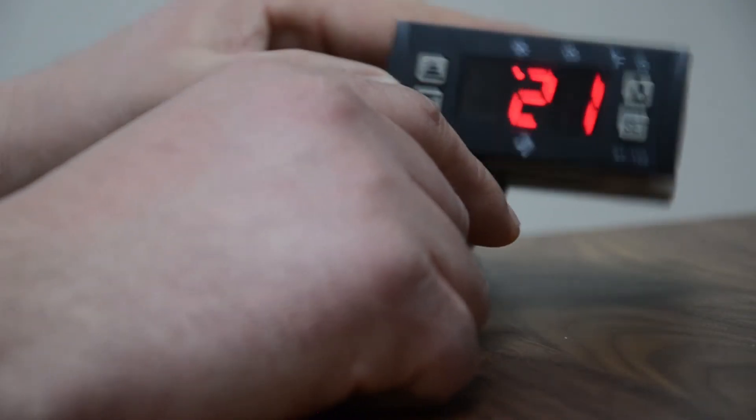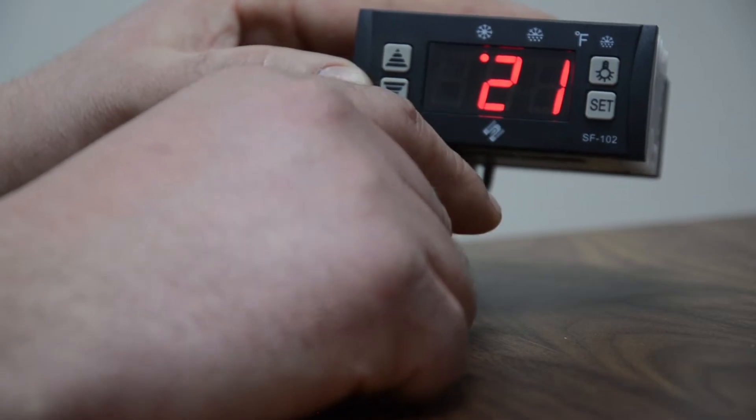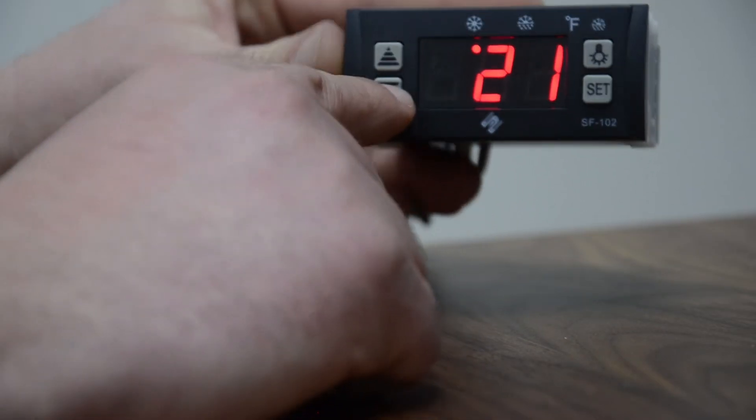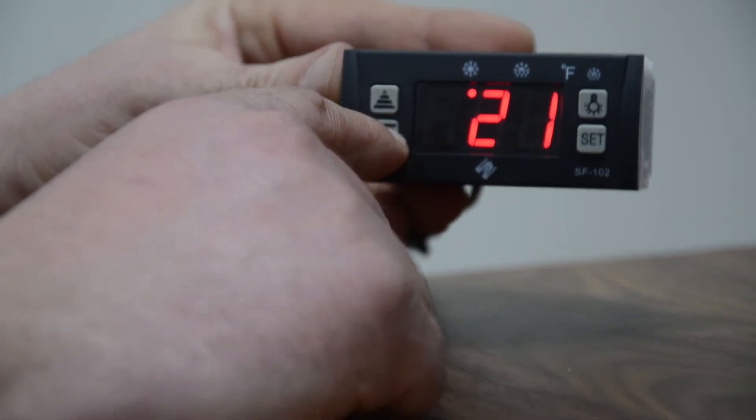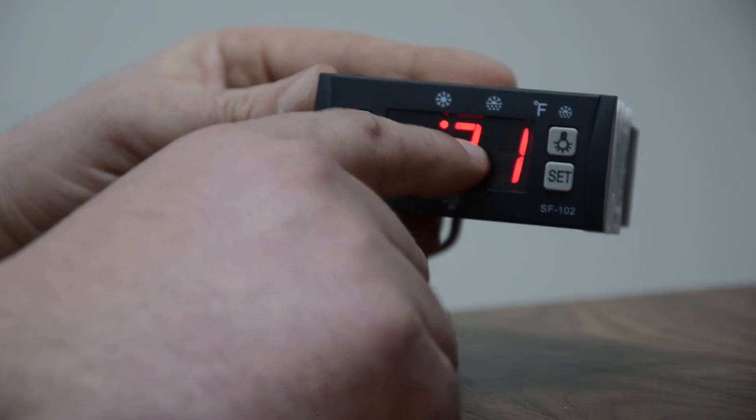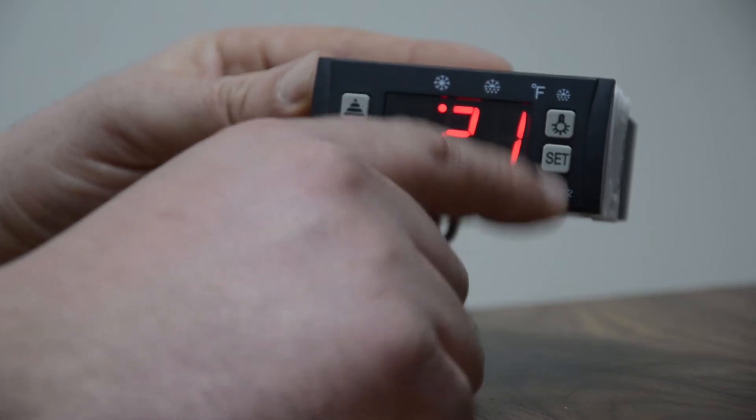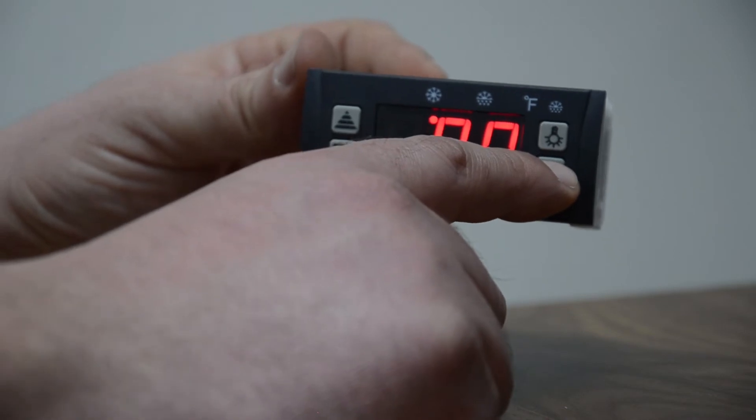Now we need to get into the parameters within this controller itself. What you would have to do is press the arrow down button and hold it for five seconds, and you would see the on display appear on the screen. Then to get into the parameters, you have to press and hold the set button for five seconds.